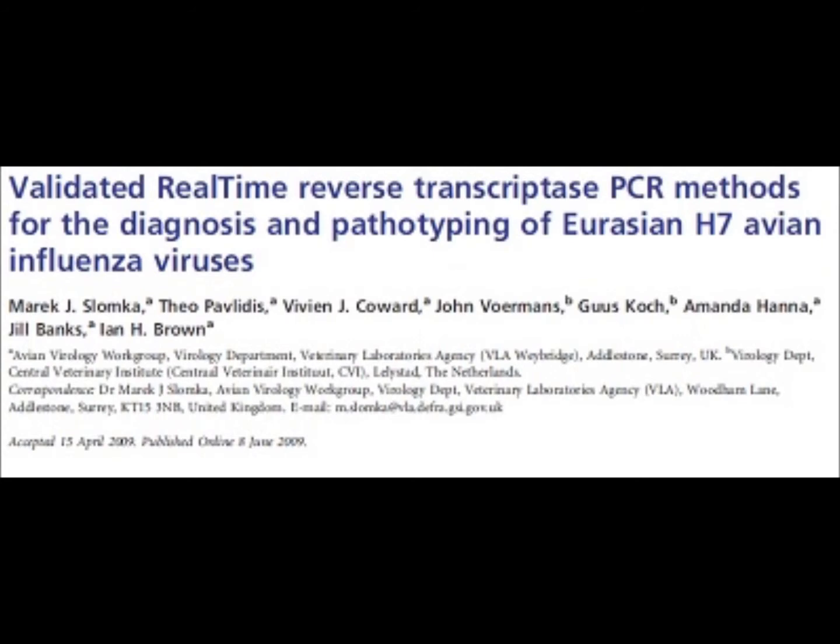All biological reactions, if they need to proceed, require water. When you lyophilize, essentially what you're doing is reducing the water content to a level where chemical reactions are not supported. Now, this helps in a couple of ways.